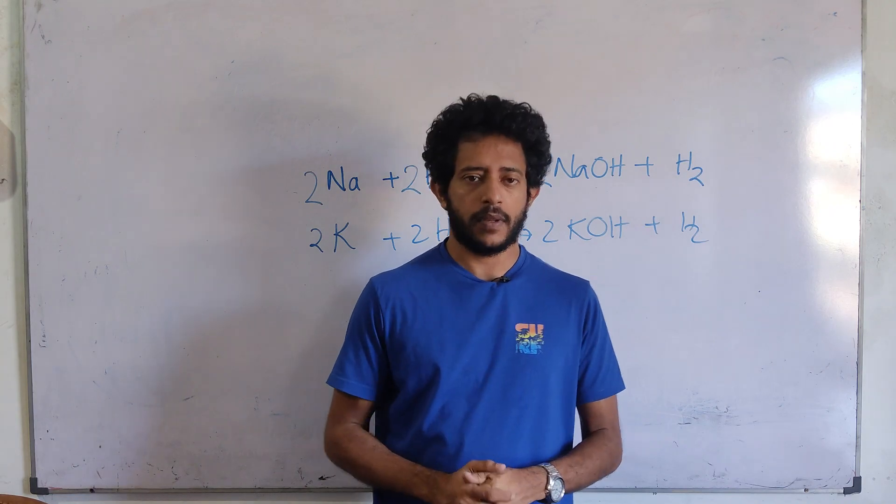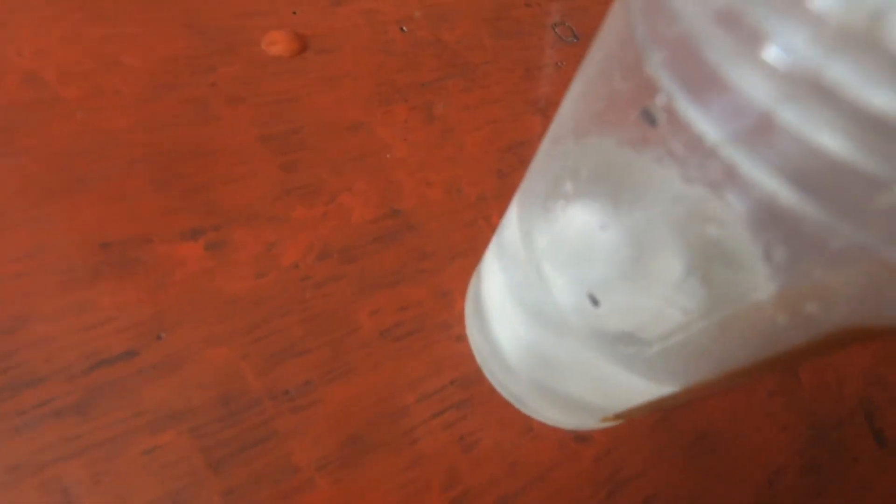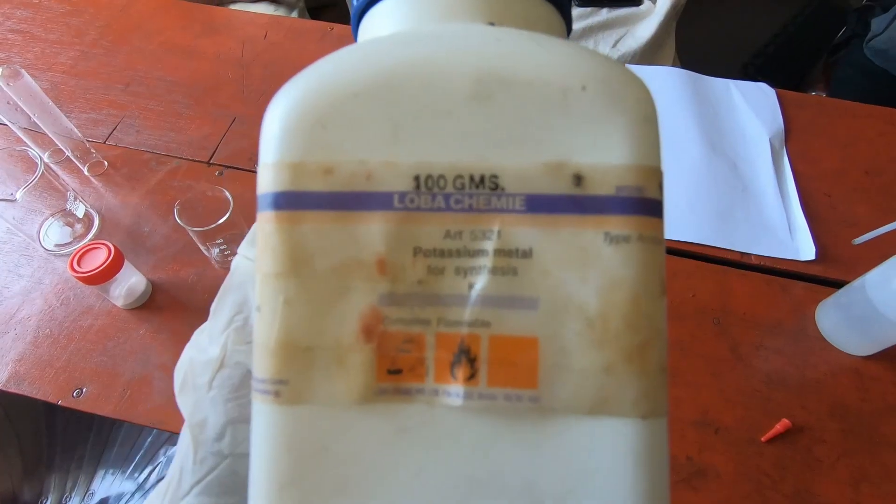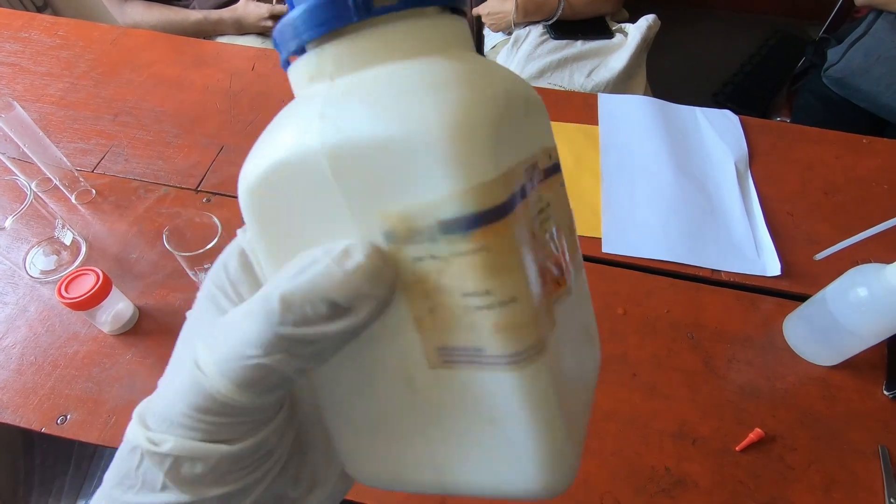This is common reactions and this is metal sodium. Sodium is stored under paraffin oil and this is potassium. Potassium also stored under paraffin oil.